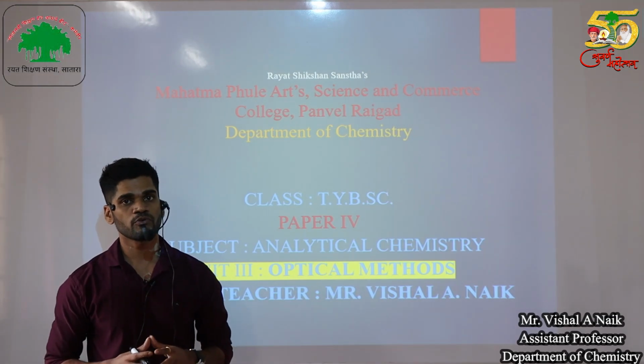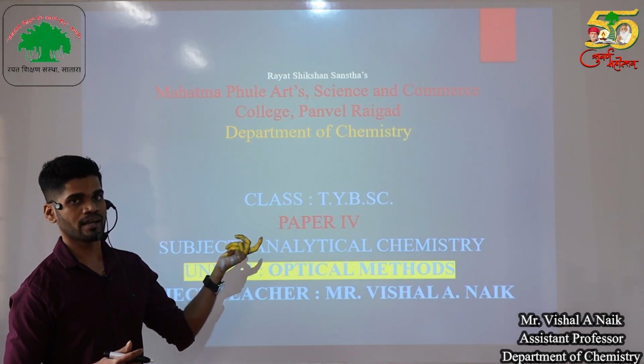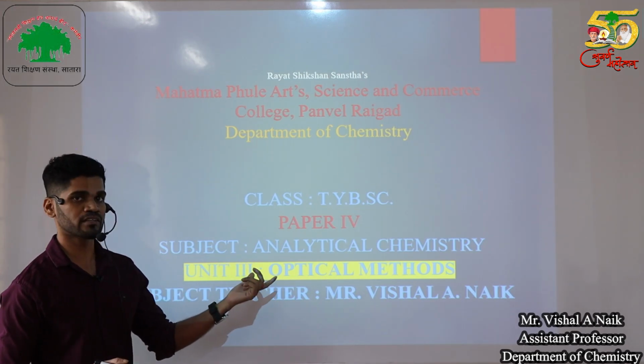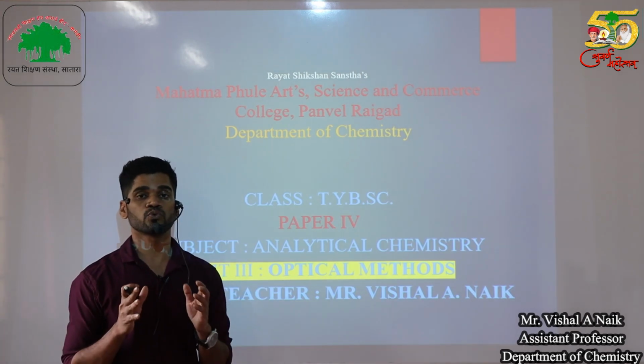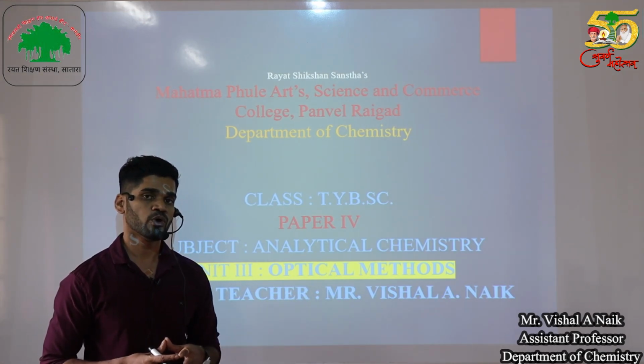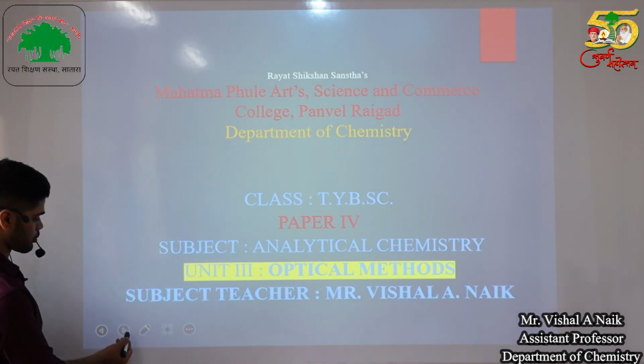So today's video topic is based on analytical chemistry, and particularly in analytical chemistry we are going to study optical methods. We already discussed one instrument, that is the flame emission spectroscopy. So in optical methods, the next instrument we have to study is the atomic absorption spectrophotometer.